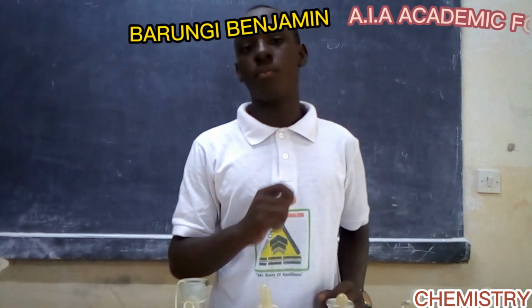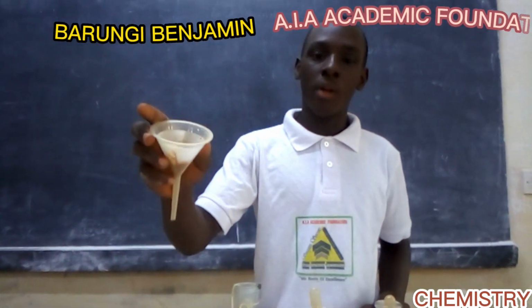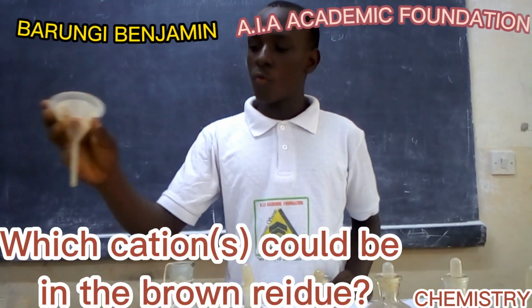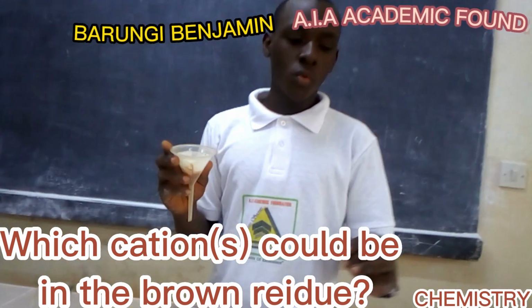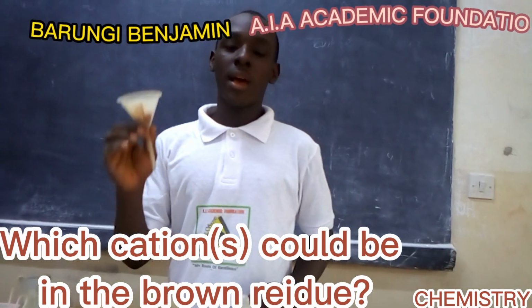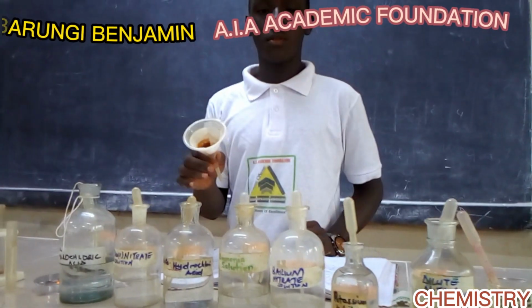But we have also obtained a brown residue, and this brown residue is always of iron 3. When you mix sodium hydroxide with iron 3 ions, they will form a brown residue.